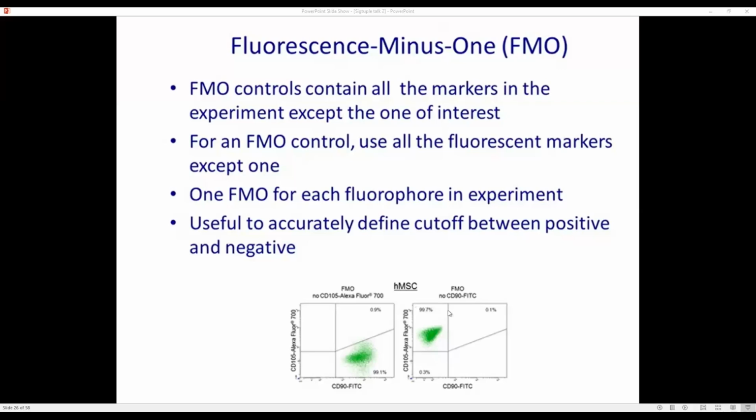I have a question. Yes, please. So is FMO experiment specific? Yes, perfect, bang on. You had the correct point. It is experiment specific. It is not like a general compensation. So it's not mandatorily done as a compensation experiment. It is experiment specific. For example, you are going to do a very sensitive experiment. You can do FMO to set your negative cutoff and then check with your experiment whether it's really positive or negative. Correct, you're right.